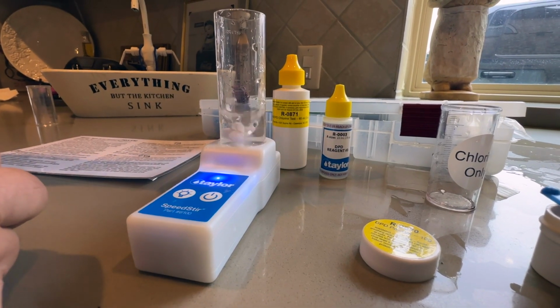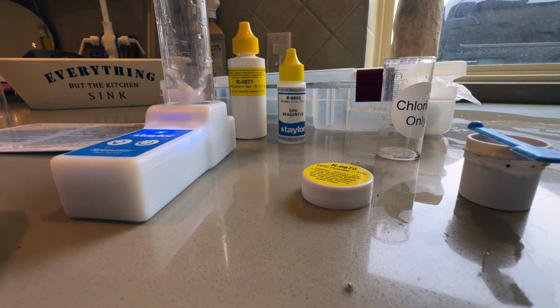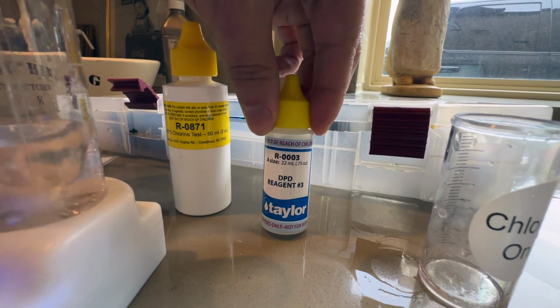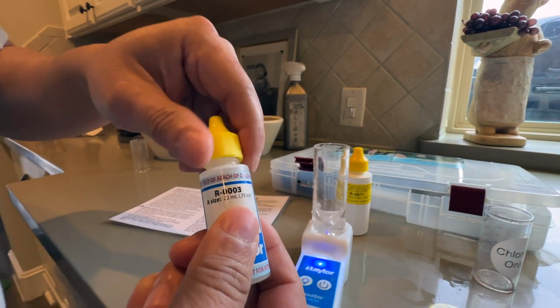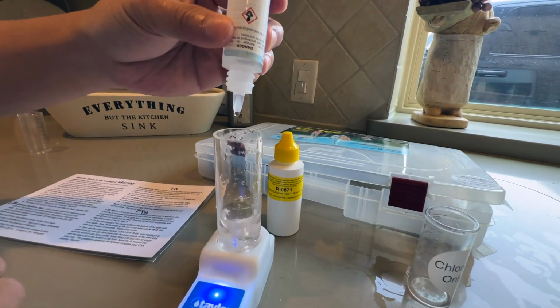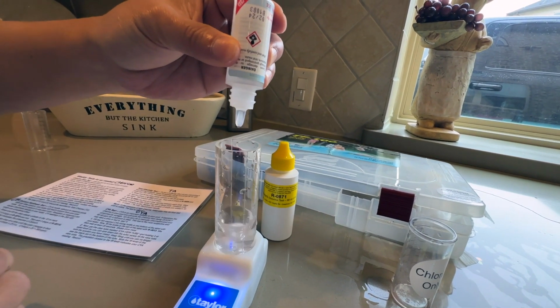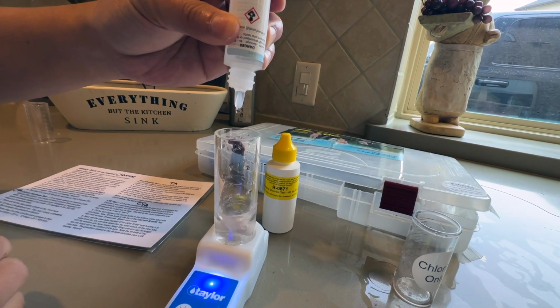If you want to, you can stop here and you've got your chlorine level, or you can continue to get what is called combined chlorine. To get combined chlorine out of this, you would want a reagent. So you're going to use this, and you're going to drop 5 drops, and it's going to turn it back to pink. 1, 2, 3, 4, 5.